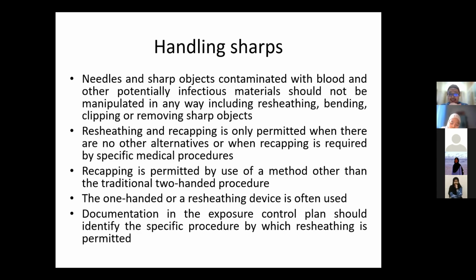Resheathing and recapping is only permitted when there are no other alternatives or when recapping is required by specific medical procedures. Okay. One-handed or a resheathing device is often used in those situations. Documentation in the exposure control plan should be able to identify the specific procedure by which resheathing is permitted.